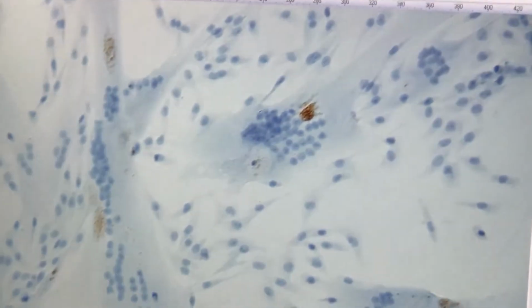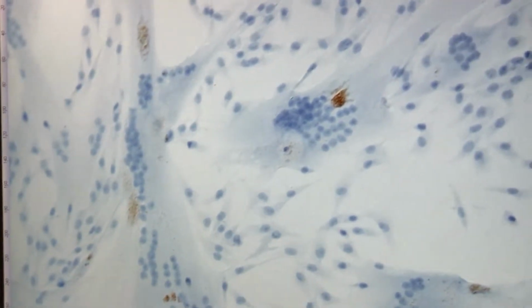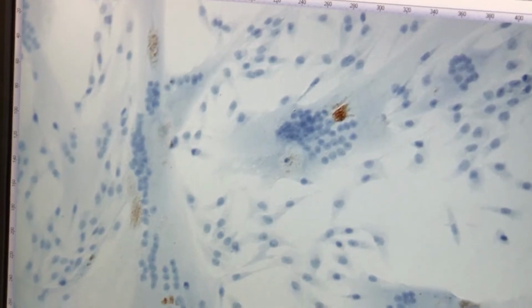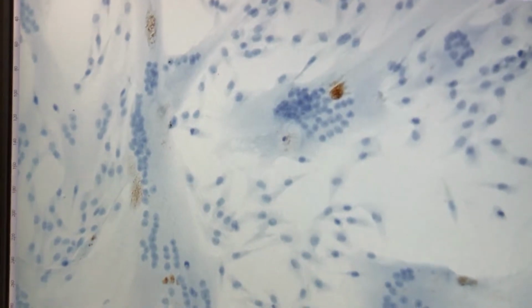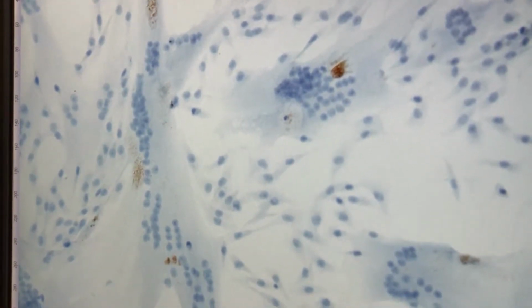And as you see, they are huge, deformed tubes that we have in FSHD patient derived cells. And as you go on with differentiation, so this is day 7. At day 7, we will see bigger, larger tubes, but after that, they start dying because accumulation of DUX4 in the cells is super toxic for cells. And at 7 days, we have a huge amount of the DUX4 messenger RNA and protein.